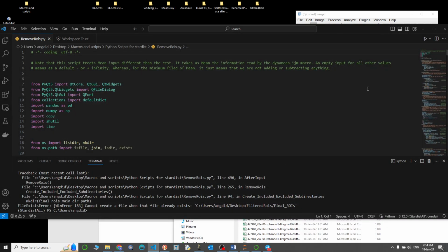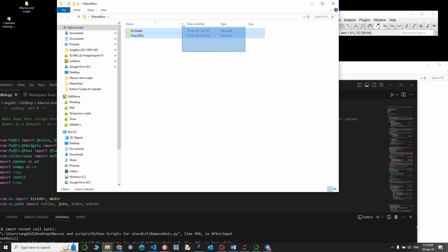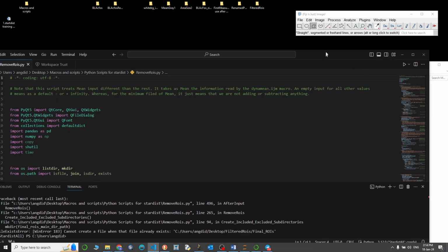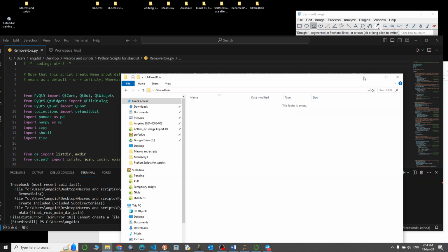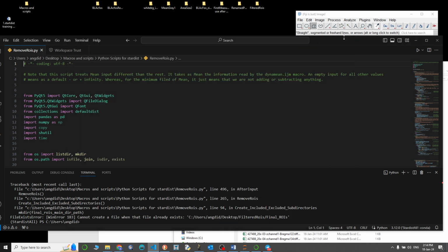Well, okay. I'm getting an error that says that a file exists. I tested it before my tutorial, and I forgot to delete the already generated folders in there, and that was the problem. So now I'm going to run it again. You might encounter this error sometimes. So if you encounter it, keep in mind that it could be that something you created is blocking your code from running properly.